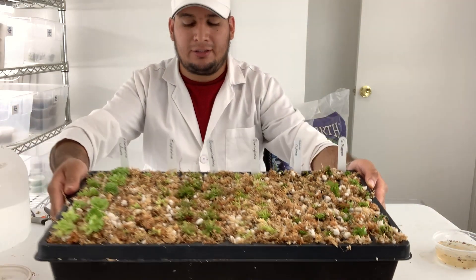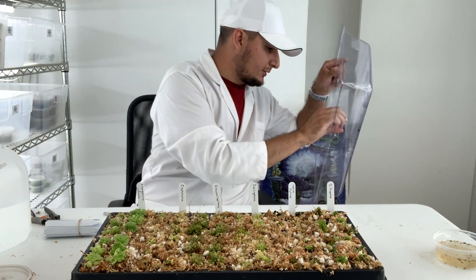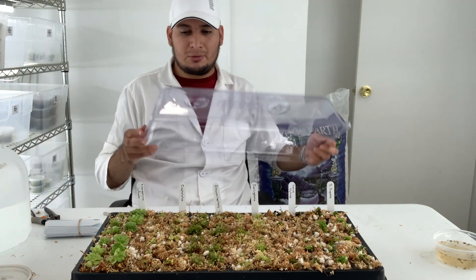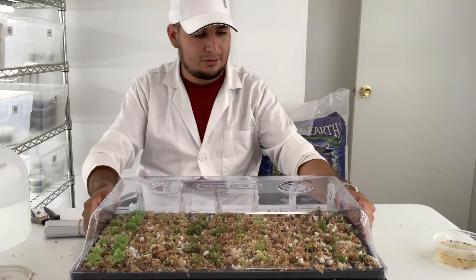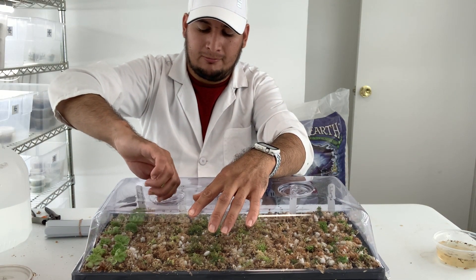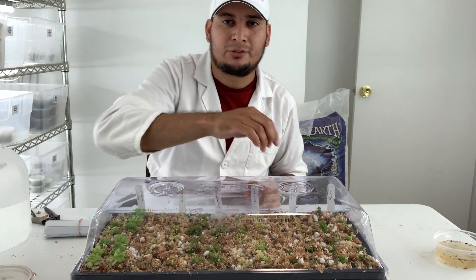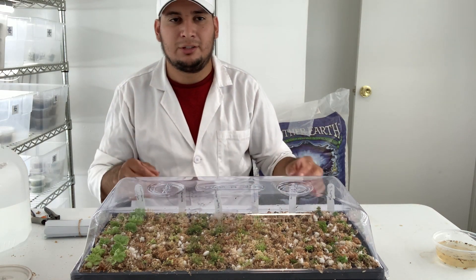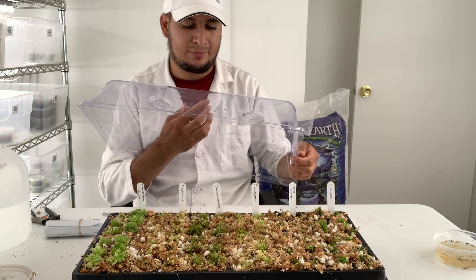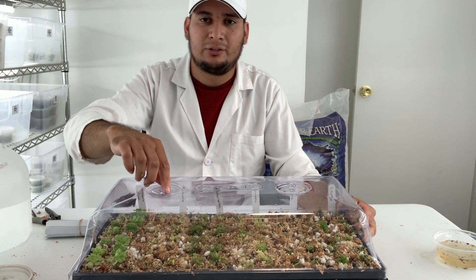All of the plants are in. The last thing to do is place the humidity dome on top and close the vents. We are pretty much done. Everything left to do is put this under some artificial lights and then slowly acclimate — slowly open the vents.